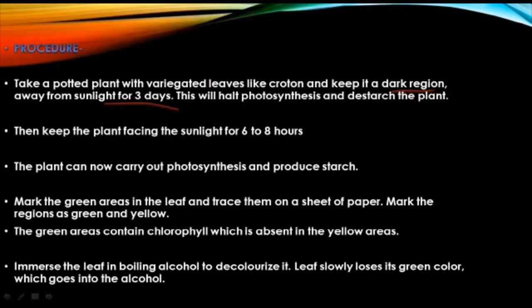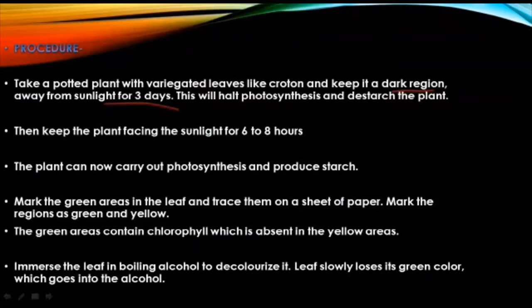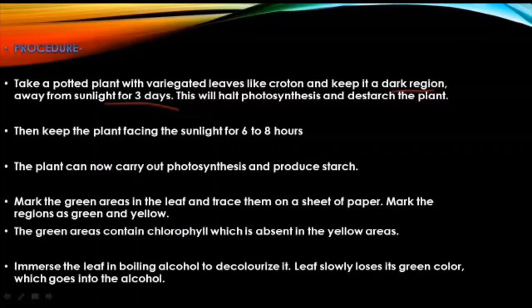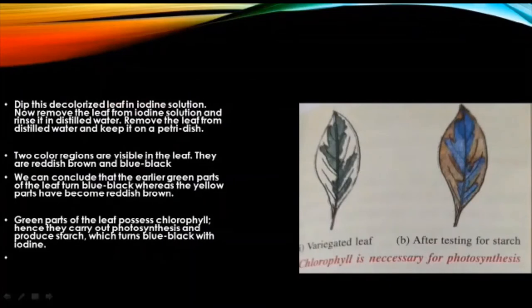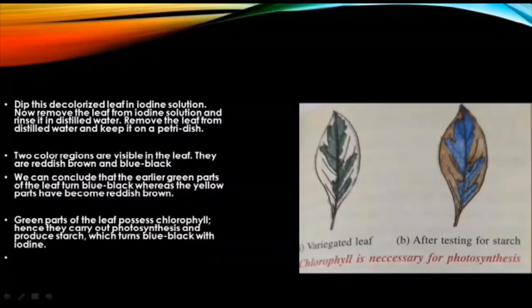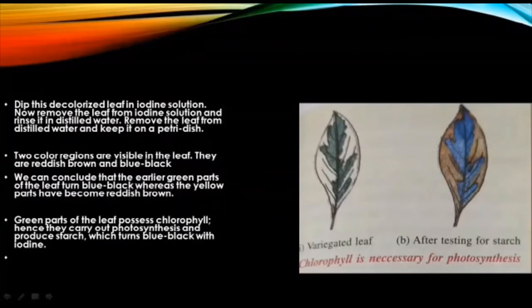We then perform the starch test. First we boil the leaf in boiling water for about 2–3 minutes, then put it inside a test tube containing alcohol to remove the chlorophyll and decolorize the leaf. Then we place it again in a petri dish containing normal water to soften the leaf, because after being in alcohol the leaf becomes brittle and can break easily. Placing it in normal water removes the brittleness. Then we add drops of iodine solution with a dropper.